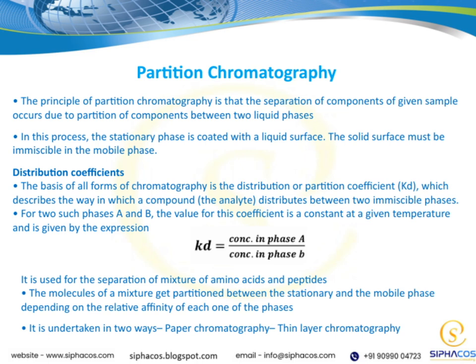In mathematical terms, the distribution coefficient relates to the ratio of the analyte's concentration in one phase to its concentration in the other. This constant helps us understand and predict how well a molecule will separate from others based on its affinity for each phase.